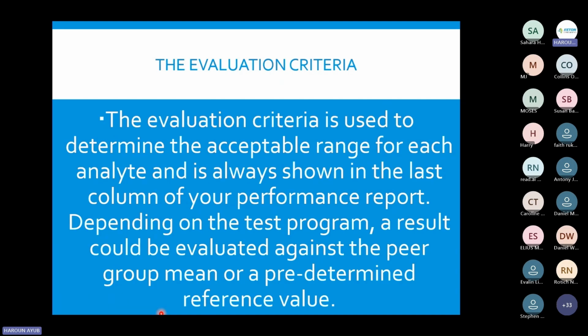So at some points, you might find that some samples may be affected, and you find half of the participants got these results and half got these results. But according to the reference or certified value, the results were varied.